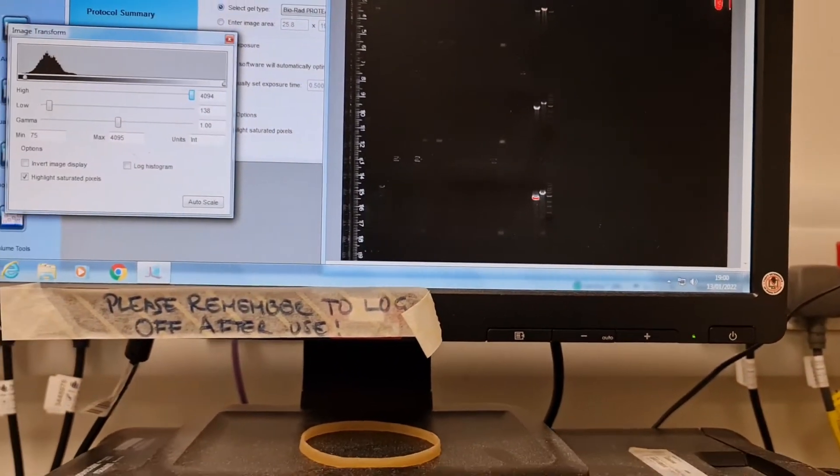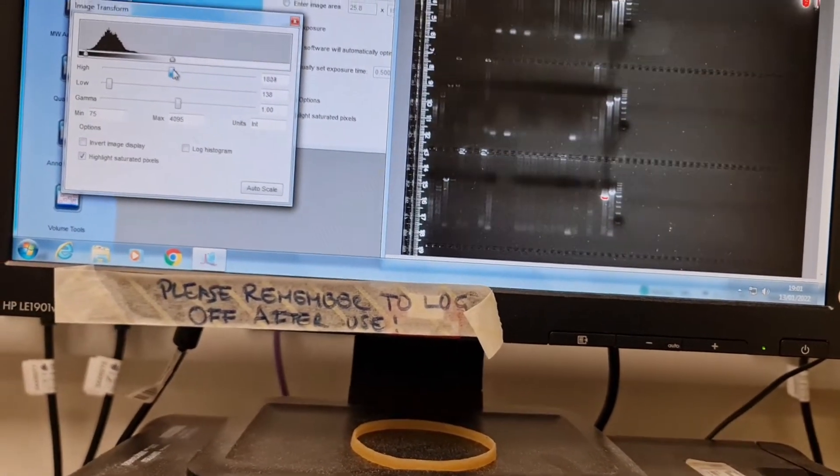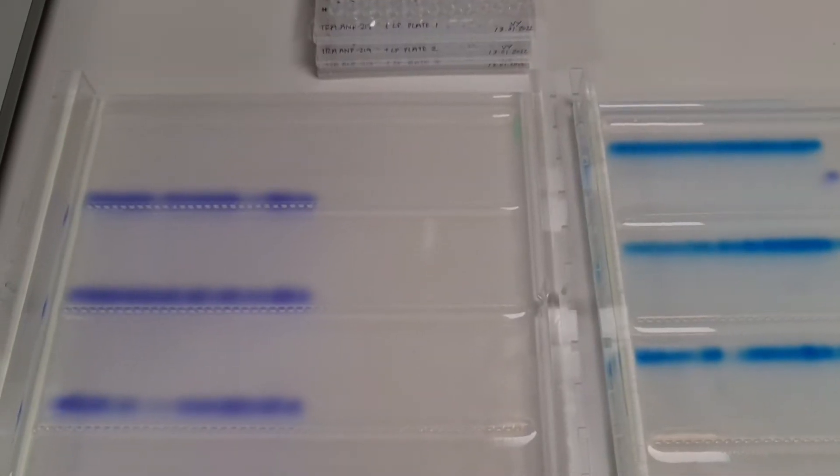That doesn't look too horrendous but it doesn't look great either. I couldn't bear to throw away my gels though.